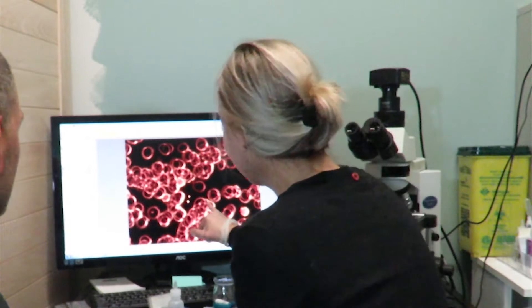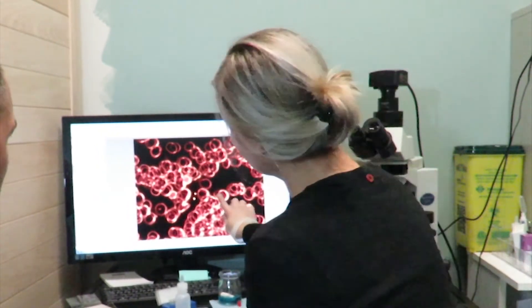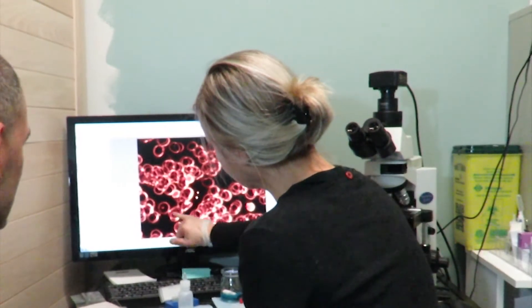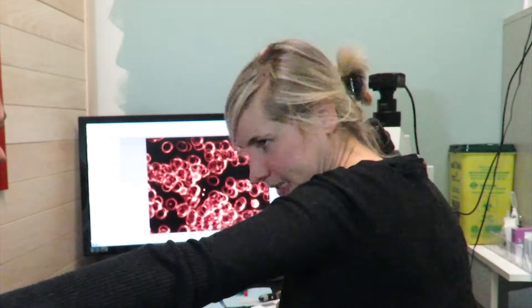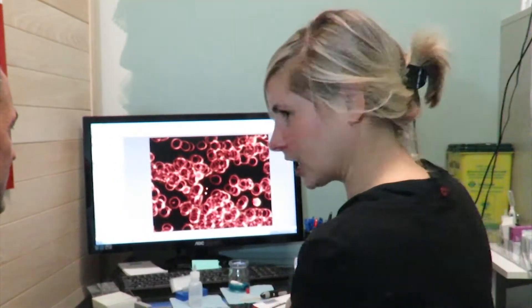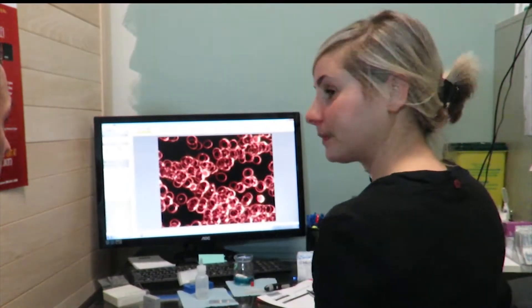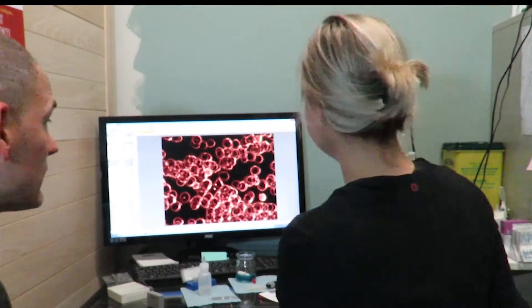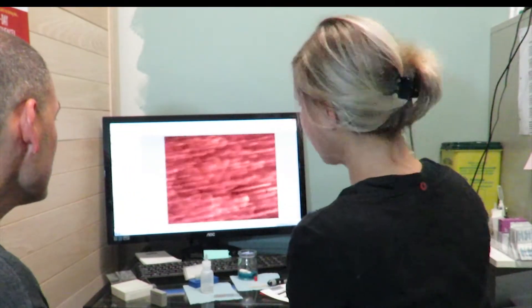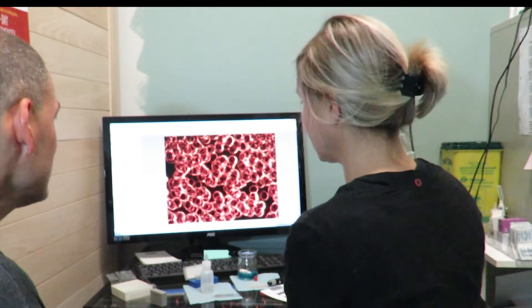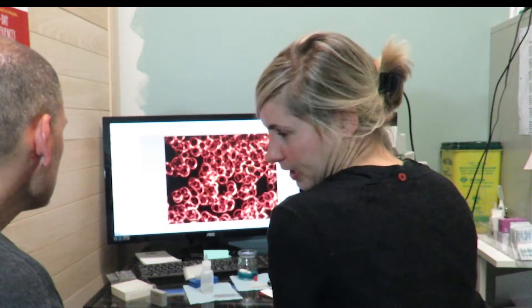This is called Rouleau. Rouleau is when the cells start to layer on top of each other like this, which usually says mental or physical stress. You need your own massage, Mr. Massage Therapist. Here, these are the Ascarius again. Most common parasite that we see. About 90% of the people that I see in the clinic have Ascarius parasites. Those are little eggs, little tiny eggs inside your red blood cell.